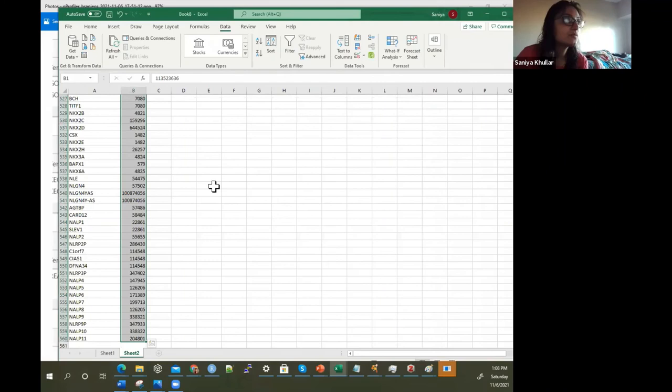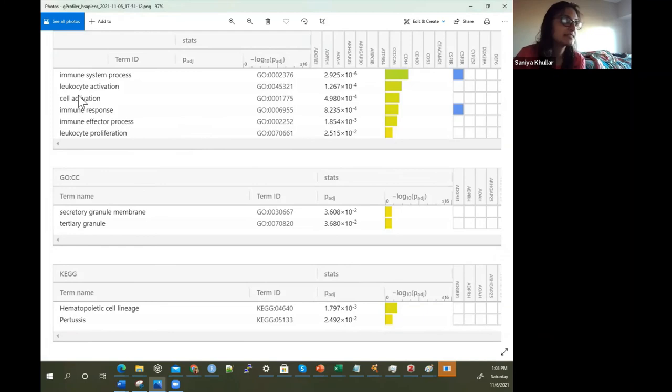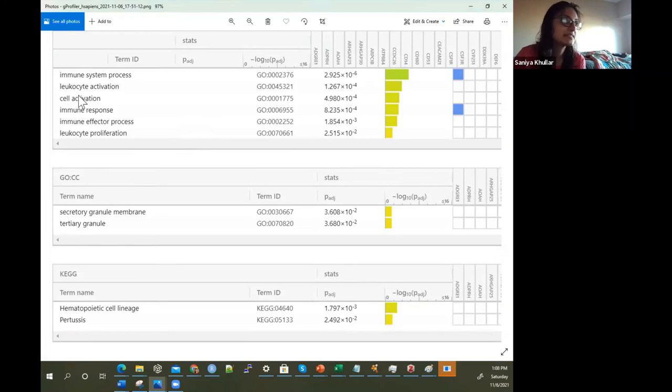The other example we had seen before was for that list of 34 genes, which were involved in immune system process, cell activation, leukocyte proliferation, tertiary granule, hematopoietic cell lineage, pertussis, immune system, and all of these things.